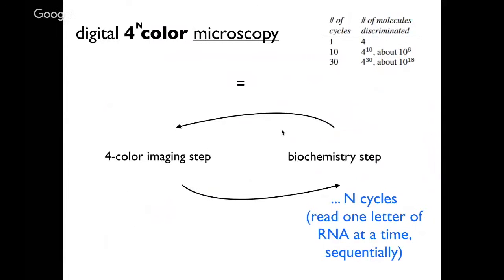And as Tony talked about, basically this mirrors the way in which, if you get your genome sequenced today, what you're essentially doing is taking your genome, getting it chopped into lots of small fragments of DNA, which land at different positions on a glass microscope slide. And then essentially the sequencing machine is actually a fluorescent microscope that takes a series of images of each of those fragments, reading out as a sequence of colors, one letter at a time, the identity of each strand of DNA. And then computationally, what people do is they take all those short fragments and they try to re-stitch that back into your genome.